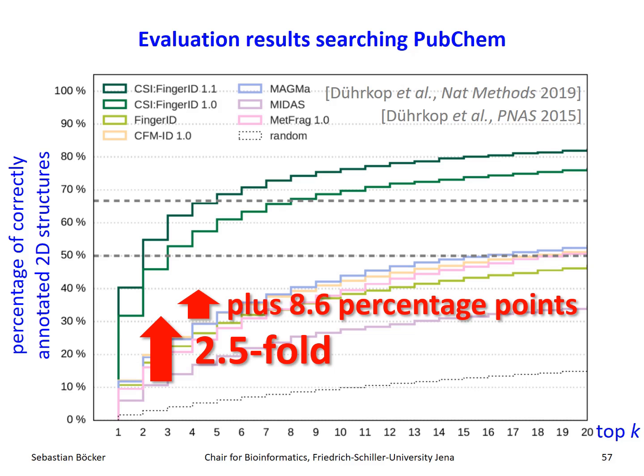And then you have 10,000 candidates in PubChem for this, say. I mean, all methods here got the same set of candidates, which were filtered by the molecular formula. We assume that we know that. See the previous talk, why. But anyway, sometimes you get 10,000 candidates, and then with 2 or 3 peaks, you have to decide which of these 10,000 candidates is the correct one. And always remember, if a spectral library would be as large as PubChem, the results would be much worse than anything that I'm presenting here. I'm absolutely sure about that. Okay?